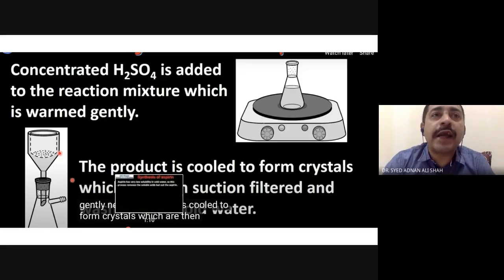So we don't want any byproduct, because in the reaction you have seen the byproduct is acetic acid, right? So we need only the aspirin. If any excess of the reactant is left, which is the salicylic acid, acetic anhydride, and the acetic acid, we don't want that one. We only want the exact mass of aspirin.